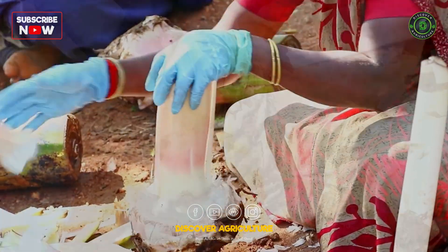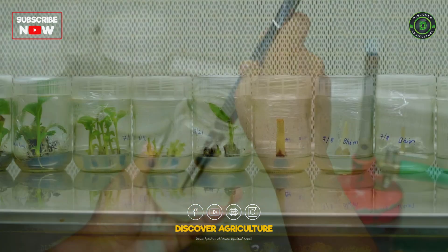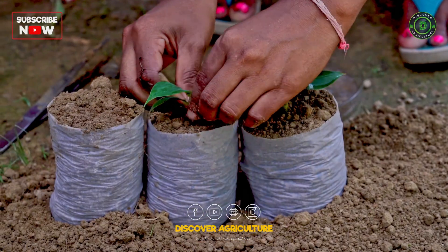In this video, we will explore the tissue culture process of banana plants, starting from sword suckers and moving through several stages of micropropagation. By the end, you'll understand how to produce disease-free plants ready for cultivation.